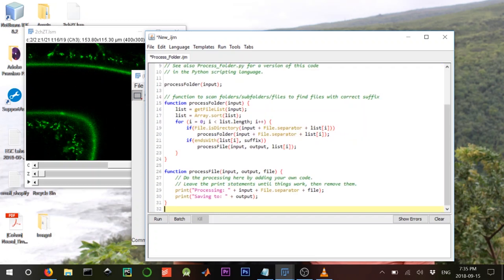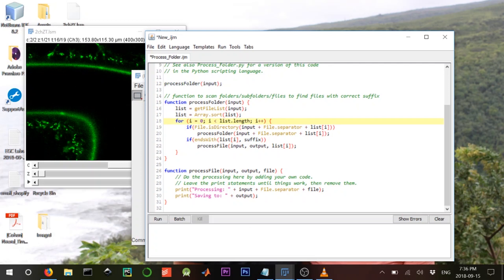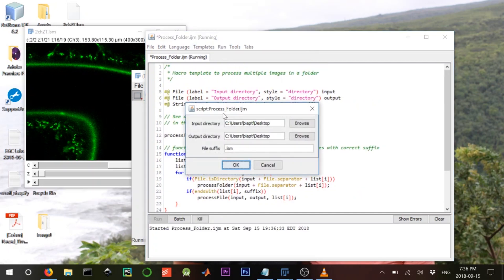Everything is already here in the template. If we run it, it will open a prompt for an input directory, output directory, and file suffix to search for. It calls the function process_folder, which recursively goes into the directory and processes each file. The only thing you need to change for batch processing is the process_file function — change that and nothing else.